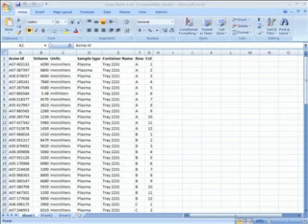This tutorial will demonstrate how sample information is imported into eLab using the import wizard. Often the manifests that accompany samples have inconsistencies that make importing them into a system time-consuming. The import wizard in eLab alleviates a lot of this burden by allowing data to be imported from different formats and by extensively checking for inconsistencies.